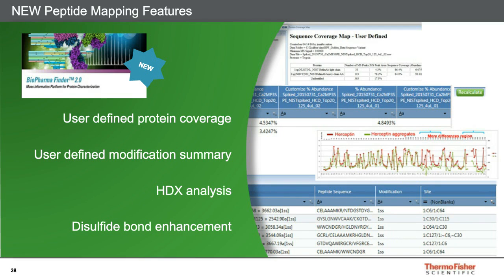We will soon launch BioPharmaFinder 2.0, and I want to give you a preview of new implemented features. For peptide mapping experiments, it's now possible to select which peptides should be used for the calculation and display of the sequence coverage. The peptides and modifications used for quantification and the modification summary can now also be defined and changed. We've integrated features for HDX experiments, for example the deuterium uptake plot. For disulfide bond assignments, we now have a column where the involved cysteines of the bonds are displayed, and with the filtering function it's very easy to display all identified disulfide bonds.